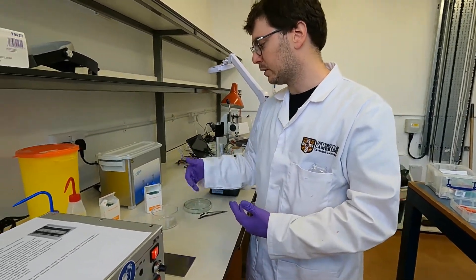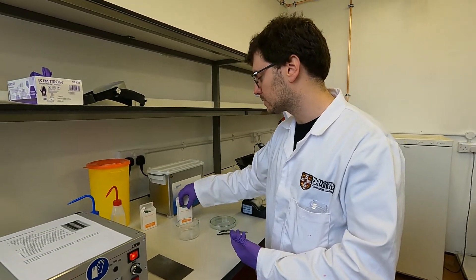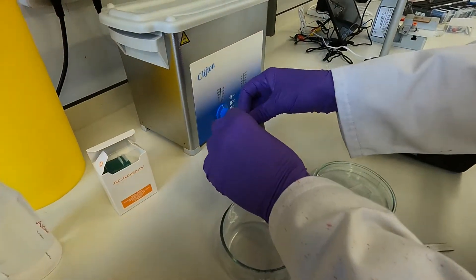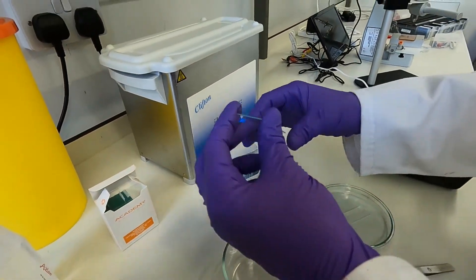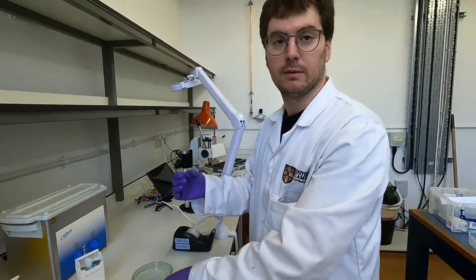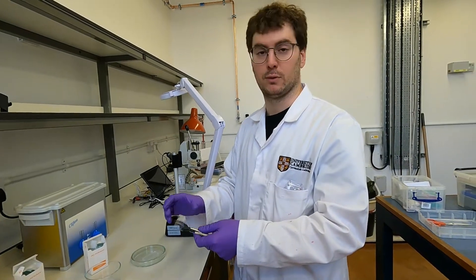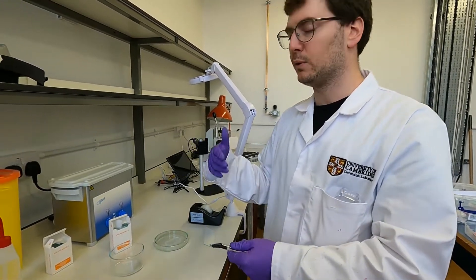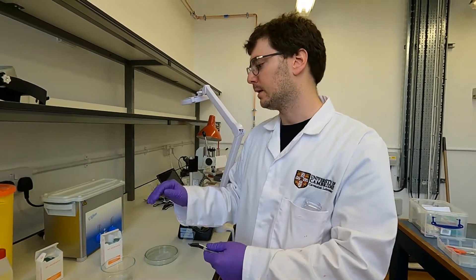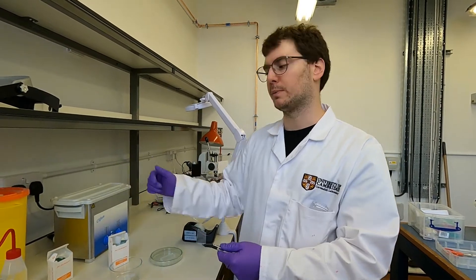We have to go through a cleaning step for the glass slide, so I'm going to take this one straight out of the box. For this demonstration I'll just do a quick rinse with acetone and isopropanol — the same as the very first cleaning step in the SU-8 spin coating process. For a more thorough clean you would use a sonicator and sonicate for about five minutes in acetone and isopropanol each.